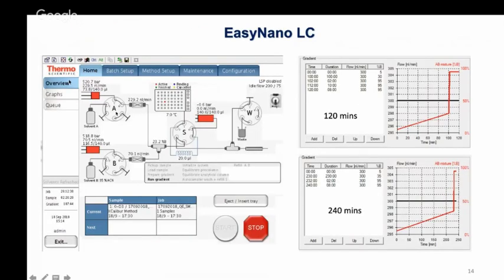And then while you are doing that, we will show you again in the nano-LC in more detail, but this is what you want to look for: the A pump, B pump, and S pump. You are looking at whether the solvents are moving properly, how much pressure is created, what is the pressure in bar. You will set up a gradient and you will see at which step things are moved. After doing the entire experiment, you want to see the gradient, let's say this is set up for 120 minutes and another gradient for 240 minutes.